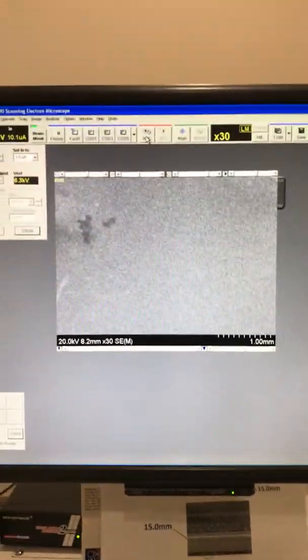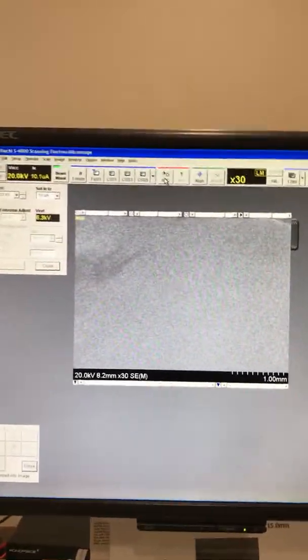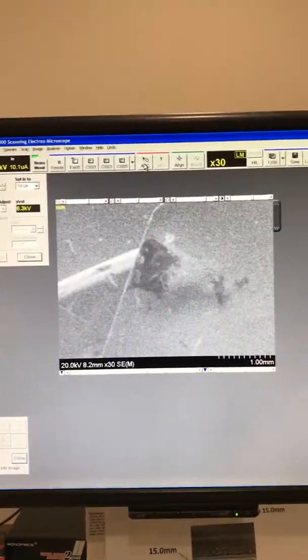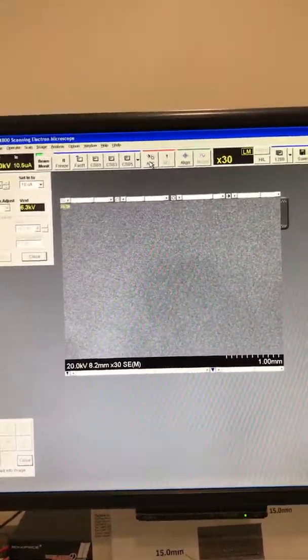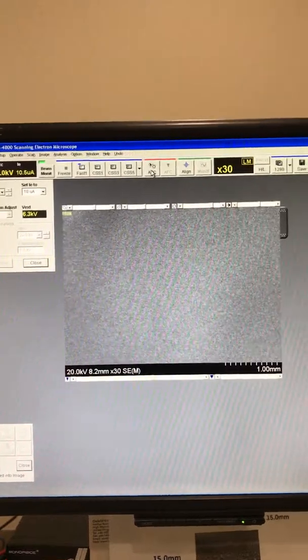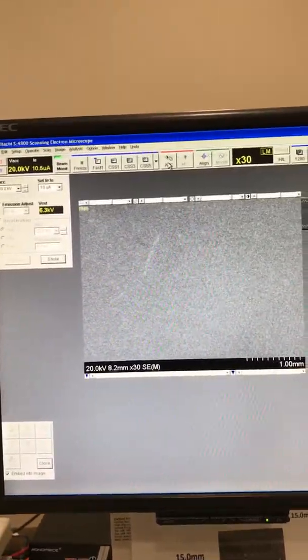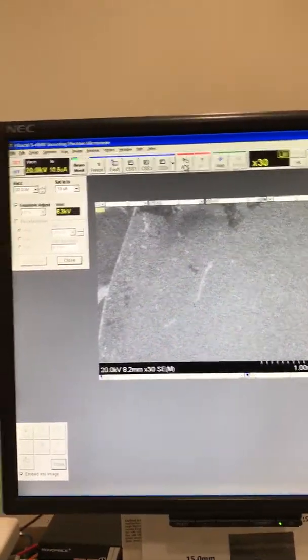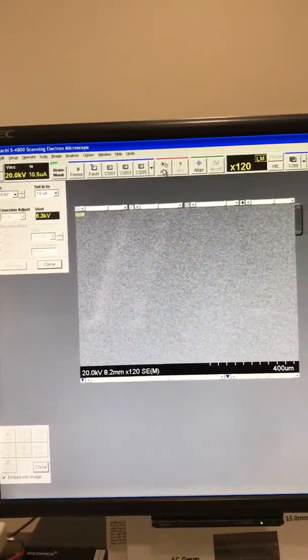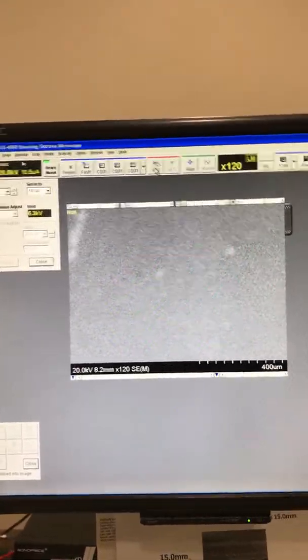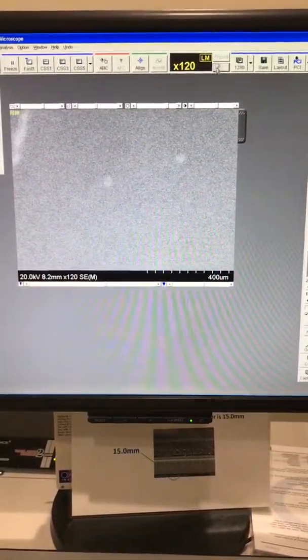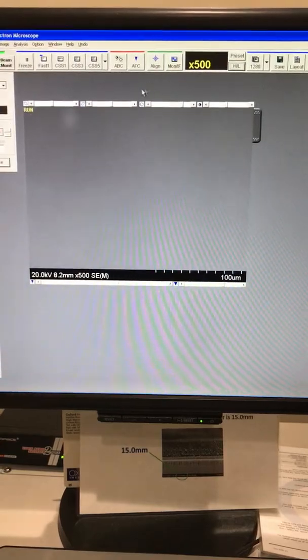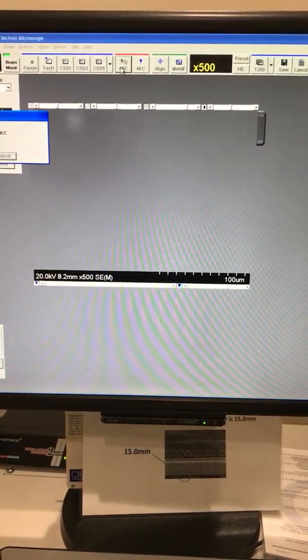Once you find your location, align your pick on a contamination, dust, or anything that can act as a clue for calibrating your machine. Pick one of these small particles, then switch to high magnification by pushing this button. Do your auto brightness and contrast.